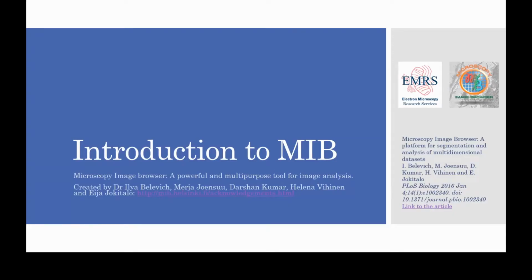I'm going to be doing some introductory videos to various image analysis software packages we use in our department, starting with Microscopy Image Browser. This is quite a nice tool developed by a team in Helsinki, and I'll start by showing you the website because that contains some useful information, and then show you how to install the software.